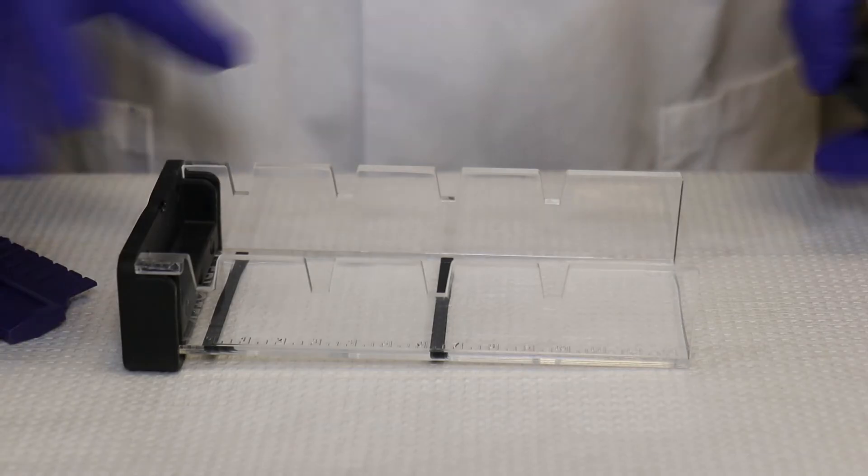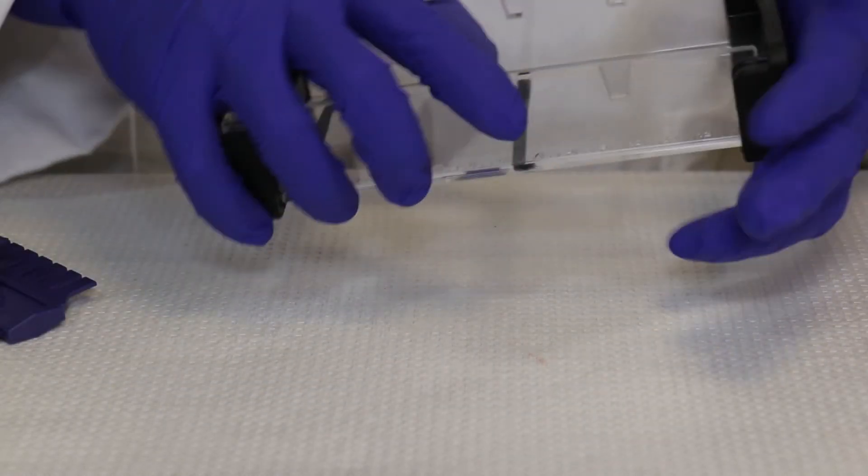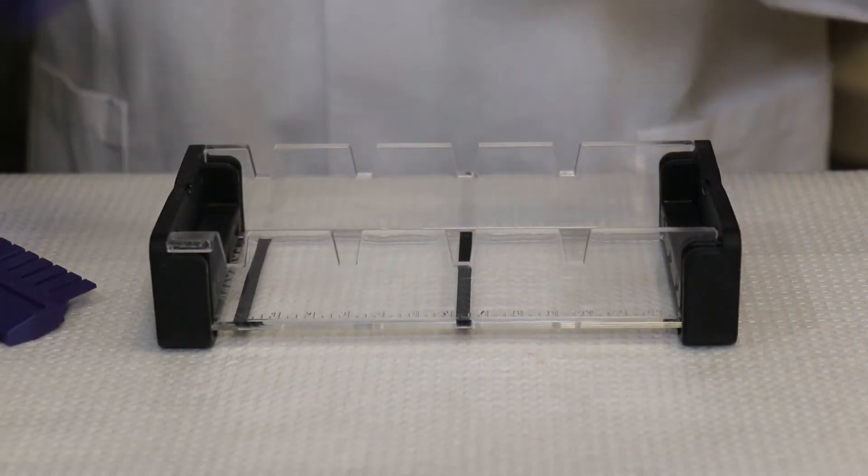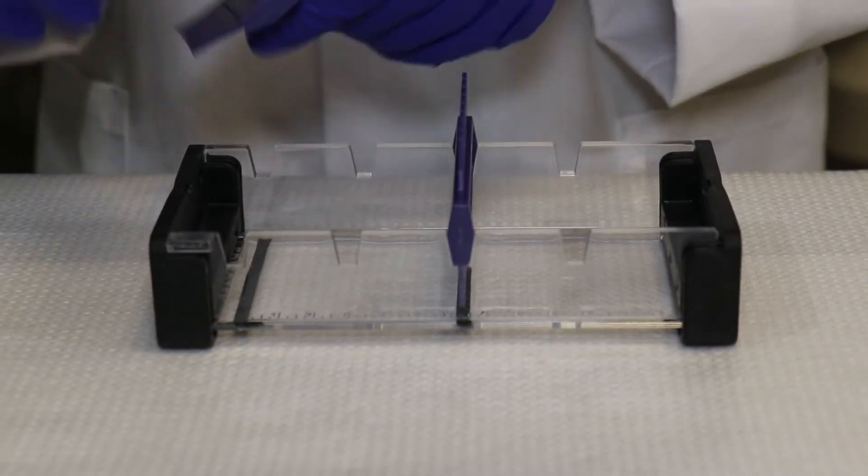Step 4: While the agarose is cooling, seal the ends of the gel casting tray with the rubber end caps. Place the comb in the appropriate notch.